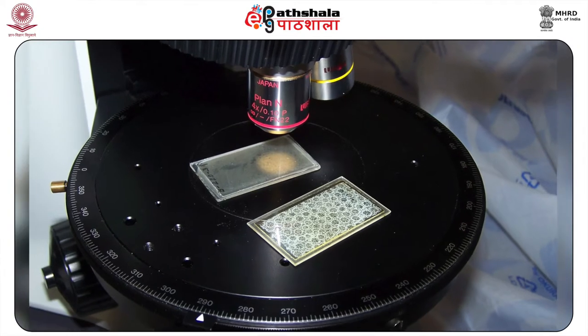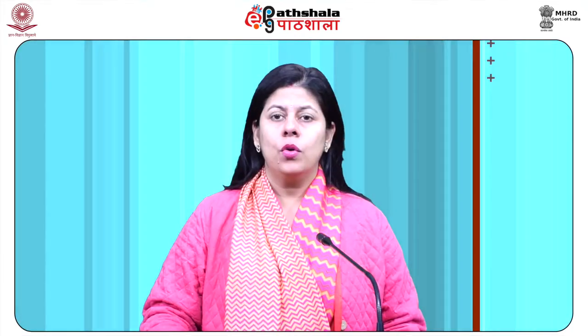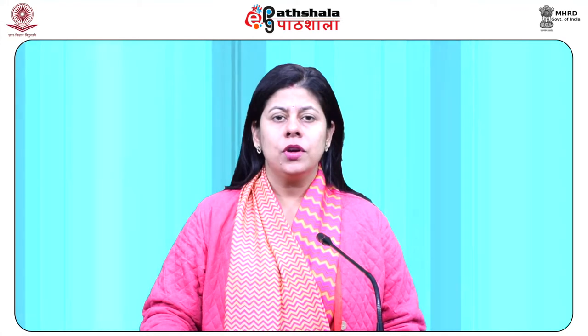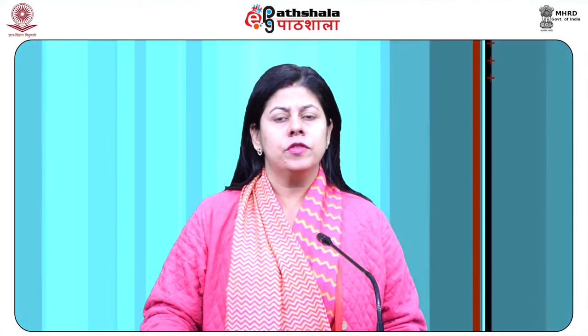Stage. A podium which holds a specimen which is being viewed is known as a stage. It is present beneath the objective. A hole is present in the center of the stage to let the light pass for illumination of the specimen.